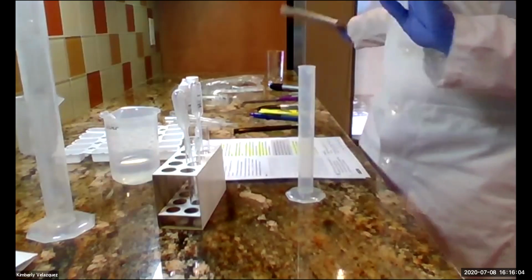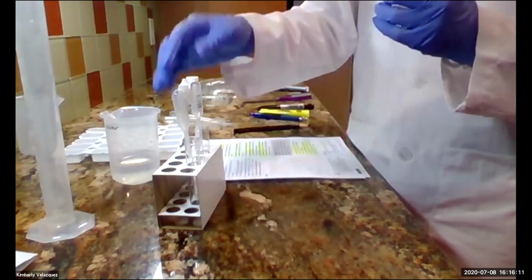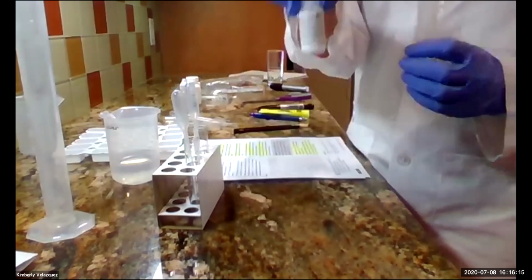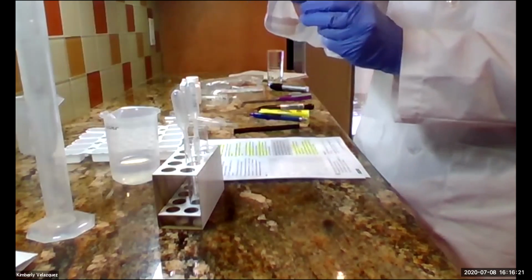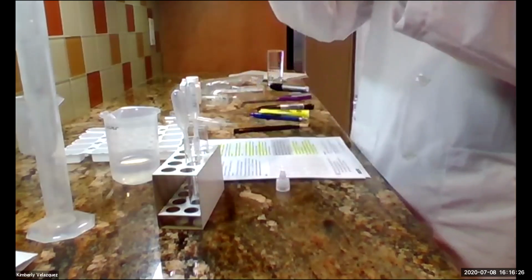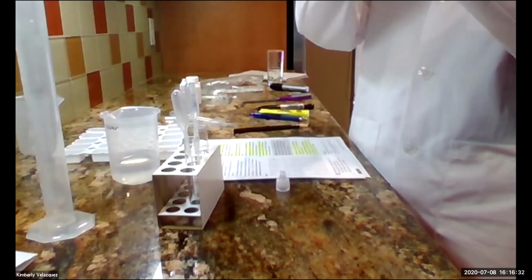Okay, so if I want to add 1.2 milliliters of my acid, what I'm going to do is take this that says hydrochloric acid. This is 1 molar hydrochloric acid. What I'm doing right now is number 7. It's the same as number 6. But I want to add enough to get to 1.2 milliliters, which is kind of hard to see on here.